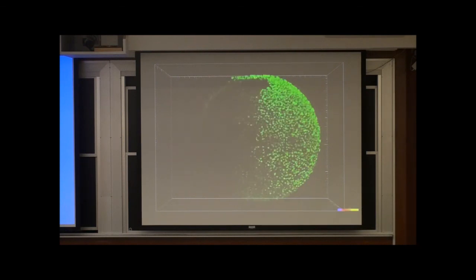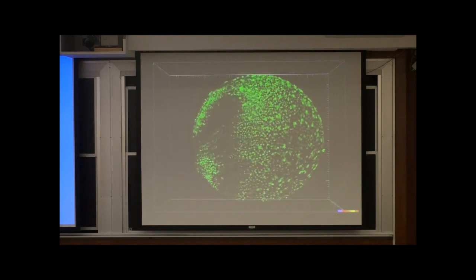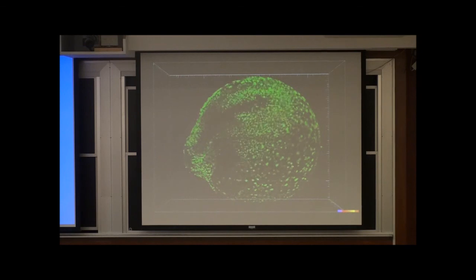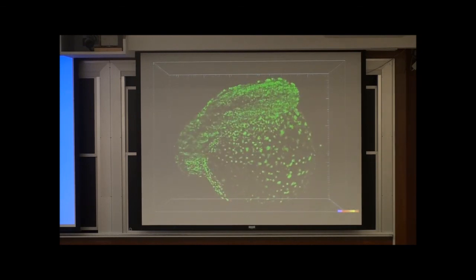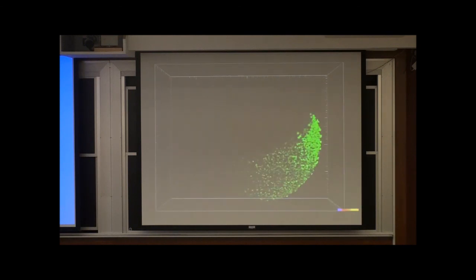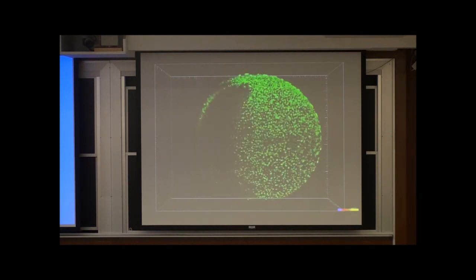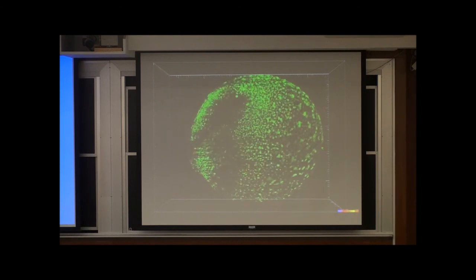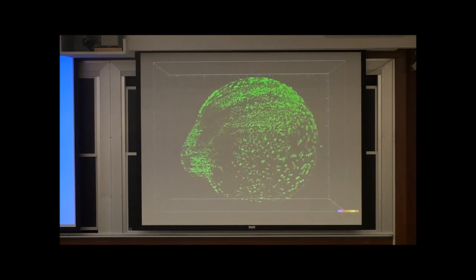Yeah, using an axicon or this kind of technique, people have already created Bessel beams, and you can have a really large field of view. On the detection side, you don't have to scan your objective. No, on the detection side it is just a flat image of the whole thing, because you are illuminating only one plane. But to go from one plane to another, I am moving the sample. Yeah, between steps I am moving the sample, in 1 micron steps.